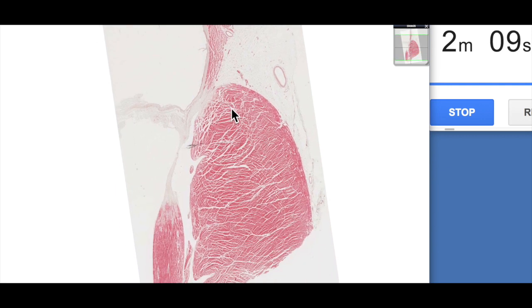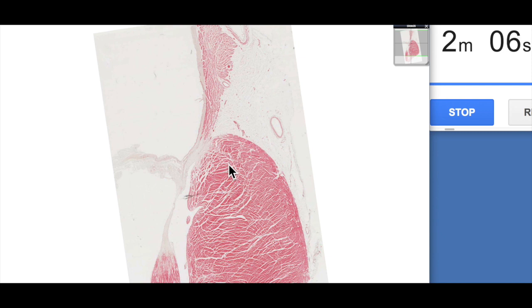Now if we have a look at a little comparison between the atrium and the ventricle, one of the major features we can see is a difference of course other than the thickness of the myocardium is the amount of connective tissue in the endocardium.